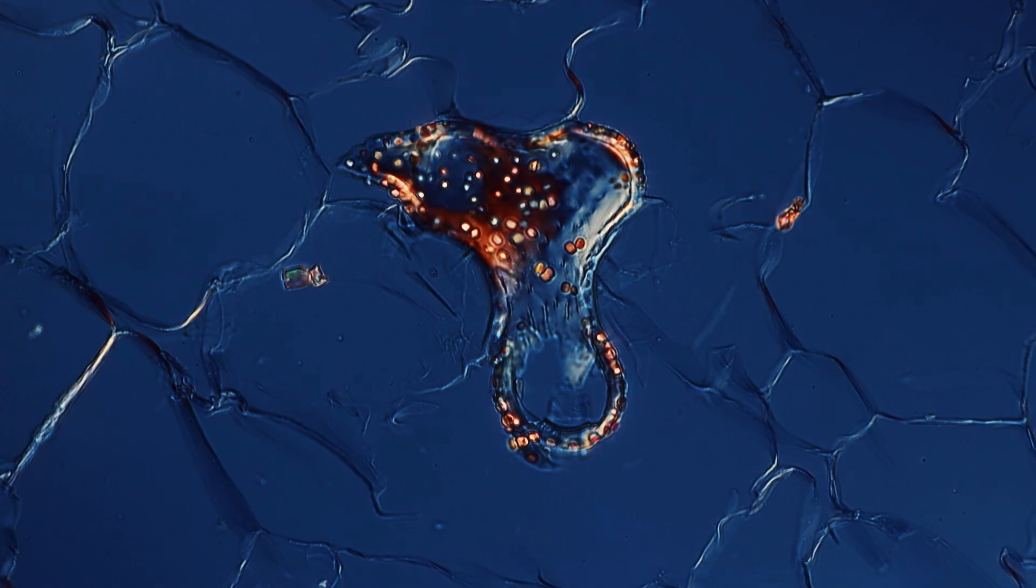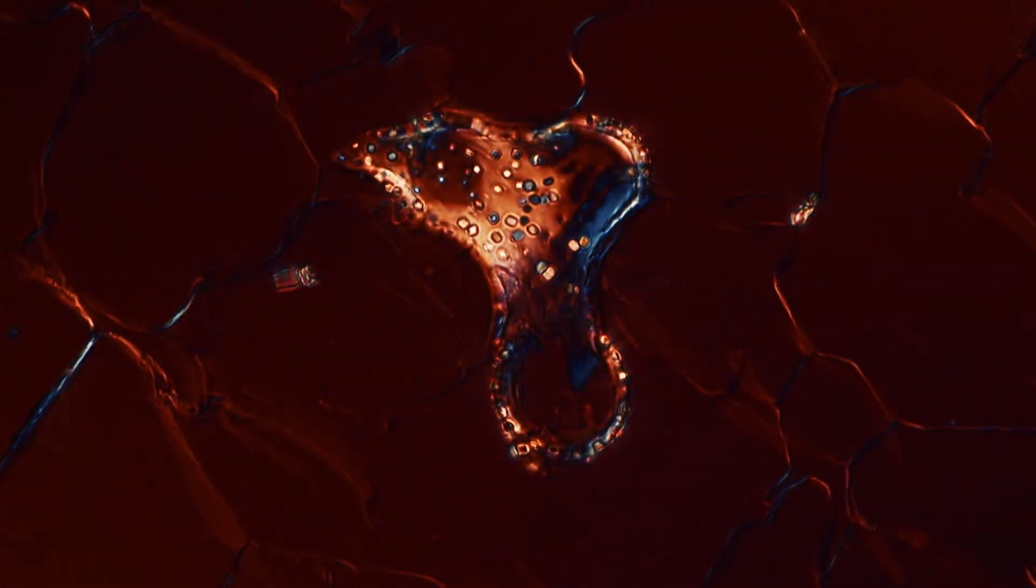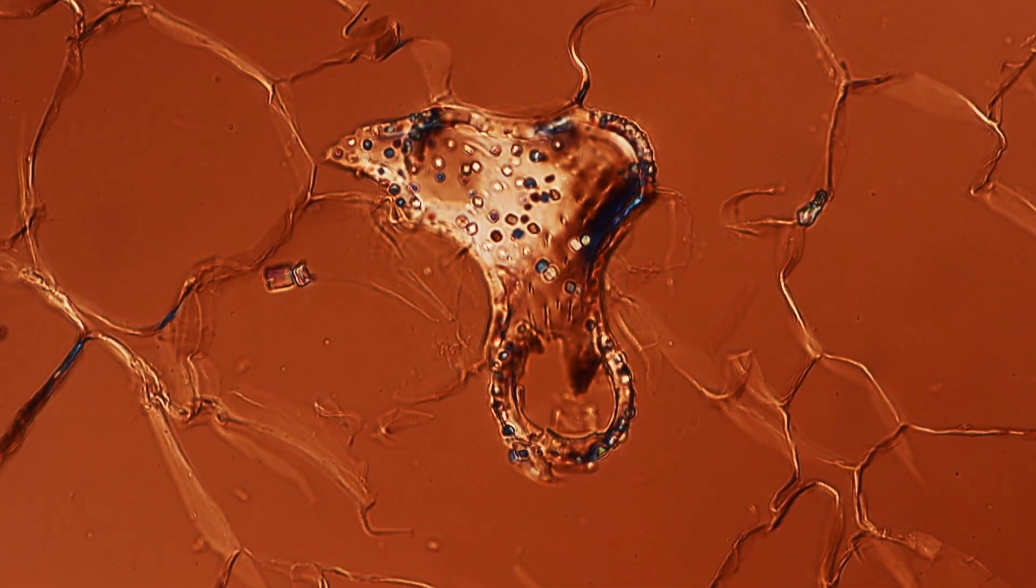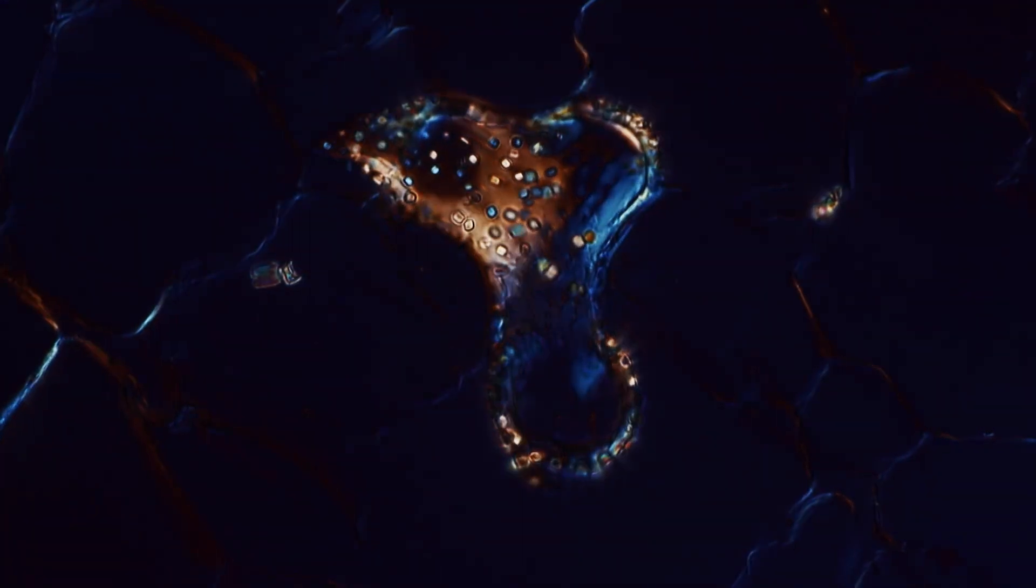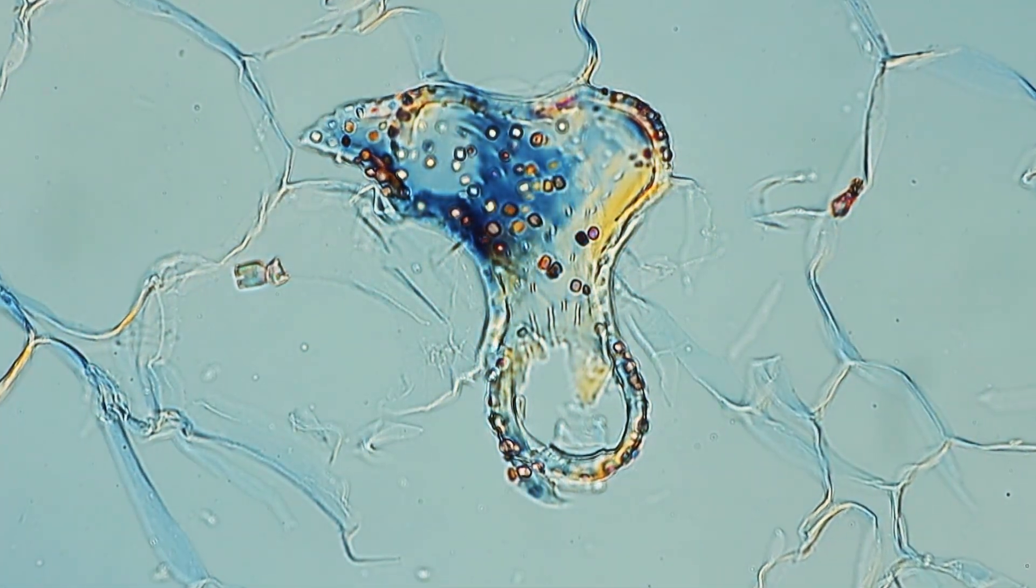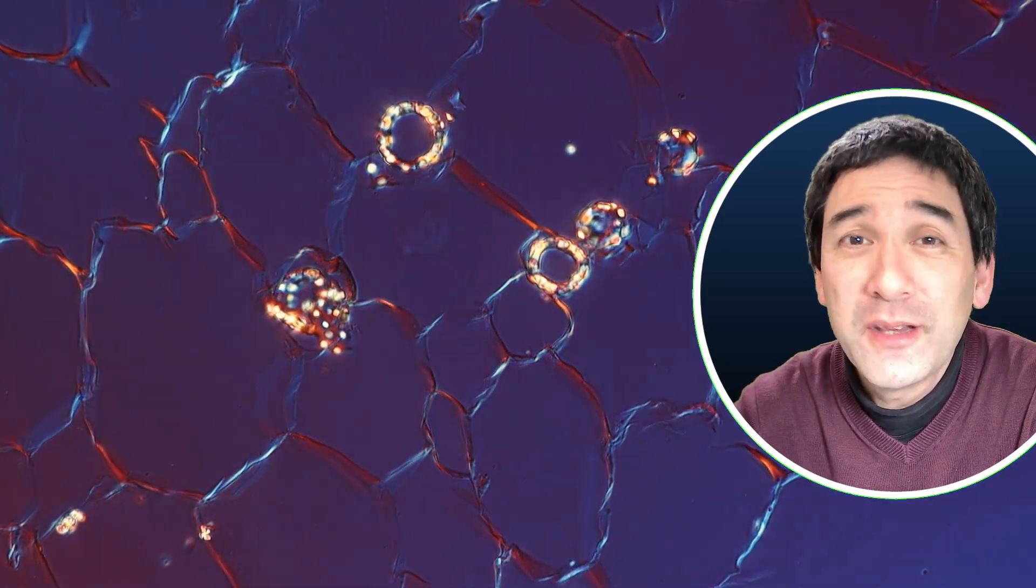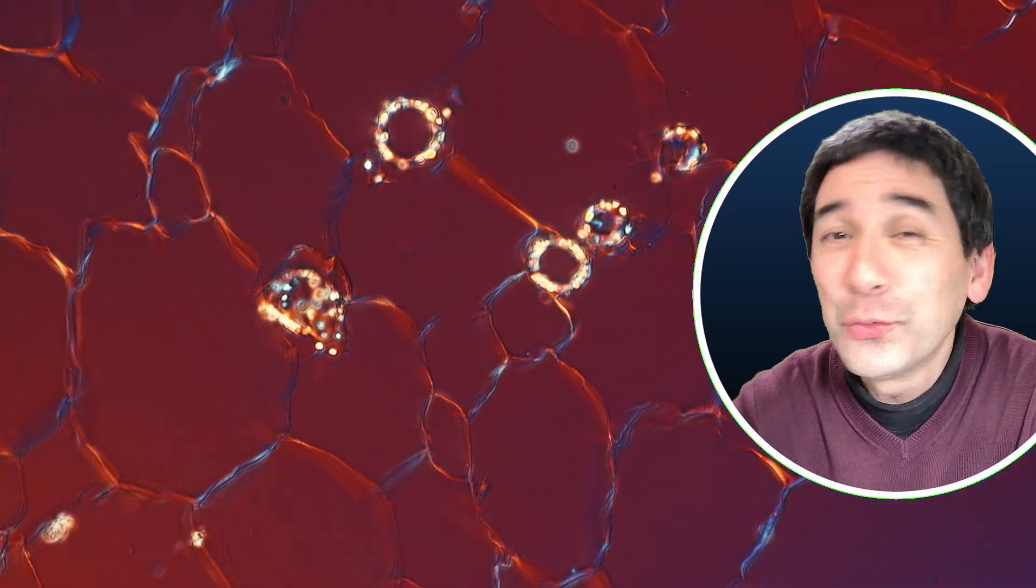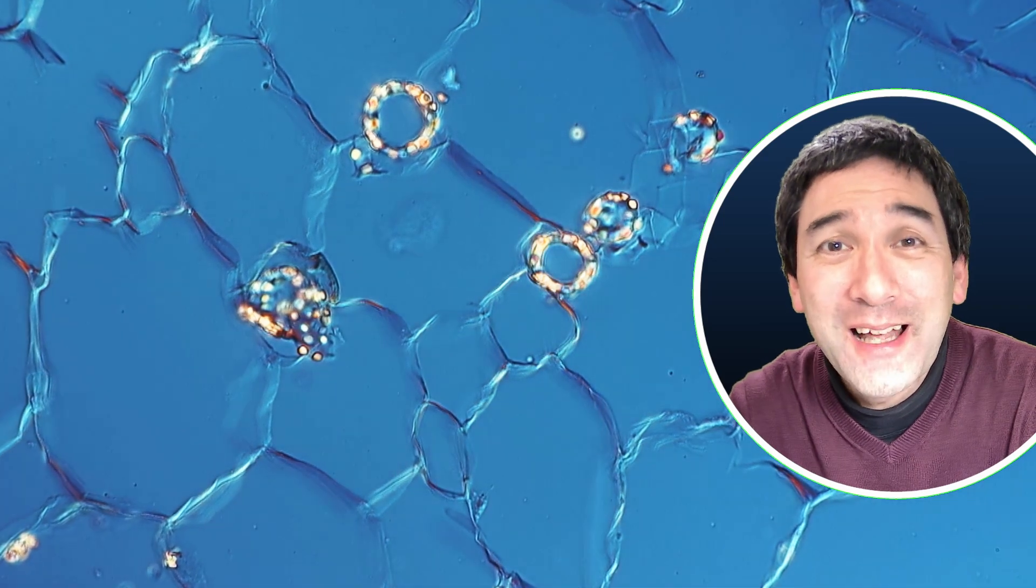Now, I've also found some of these crystals in the periphery of the stem. They look a little bit ring-shaped and I was wondering why. I think that one of the reasons could be that this might be a cross-section of those idioblasts - maybe I'm just looking at it from a different perspective and therefore it appears round. I'd have to do more research on that, but in any case I was very happy that I received those slides as a Christmas present.